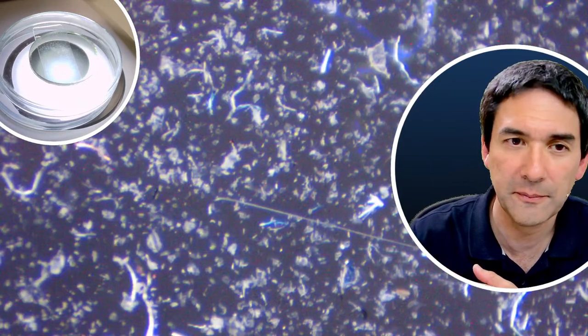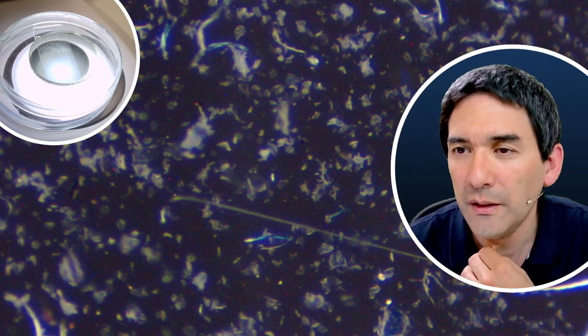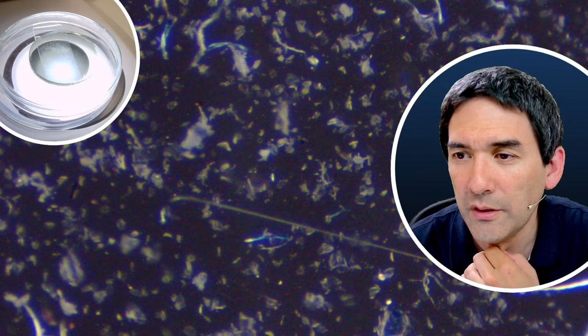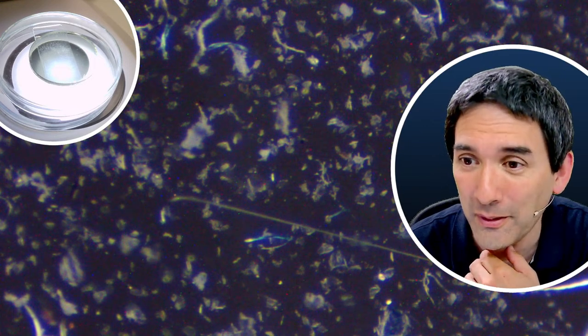Yeah, here we go. So that's basically it. Let's zoom out a little bit. That's kind of house dust under the microscope. Okay, so I think I'm going to leave it at that. Maybe a leg from a carpet beetle, if I have one. You don't want to have carpet beetles in your home.